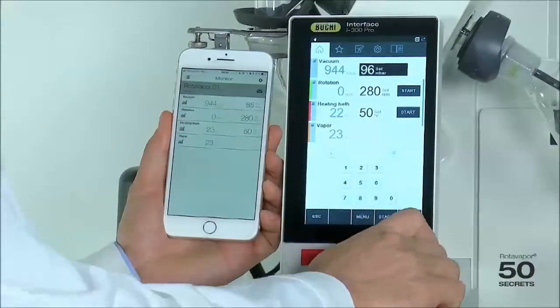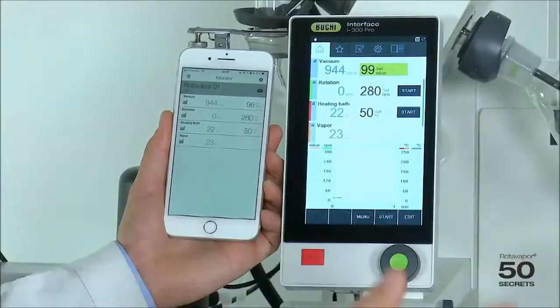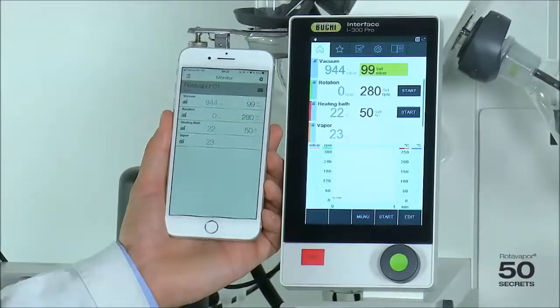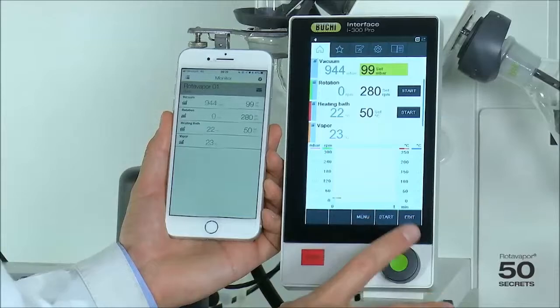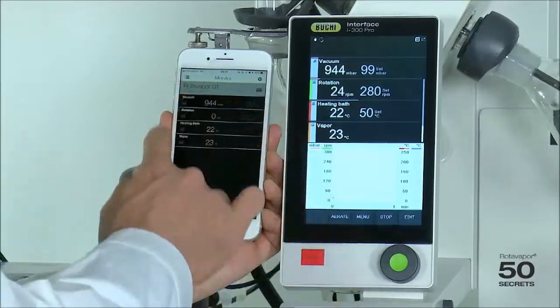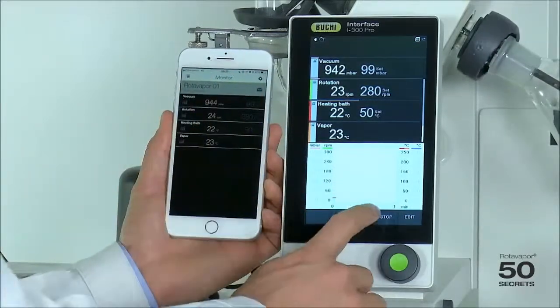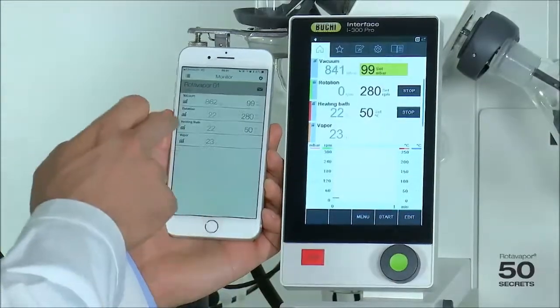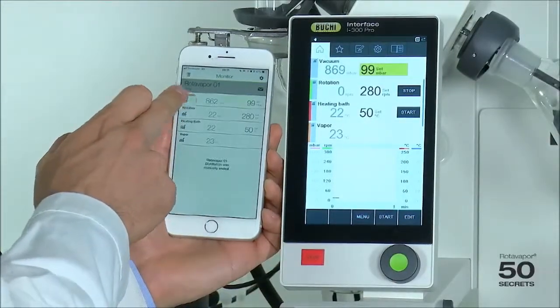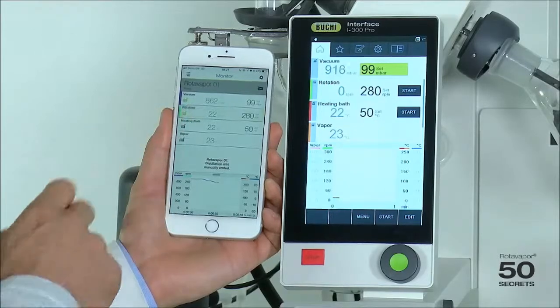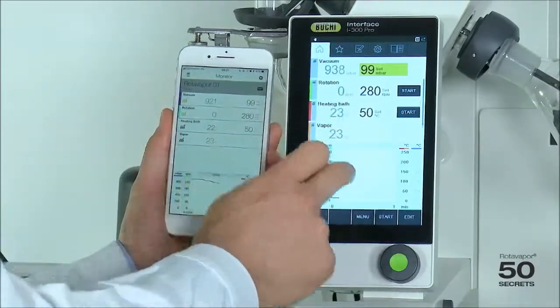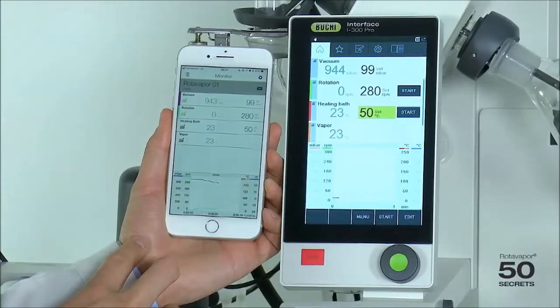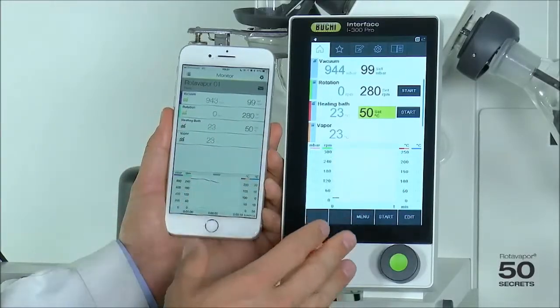If I change this to, let's say, 100 or 99, I can immediately see the change happening over here. The same applies if I press start — I can see the screen turning black. I can also enable and disable the curves by clicking, just the same as on the i300 Pro. The functionality is exactly the same.